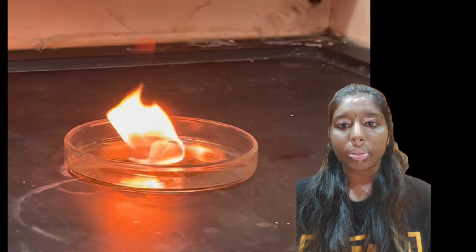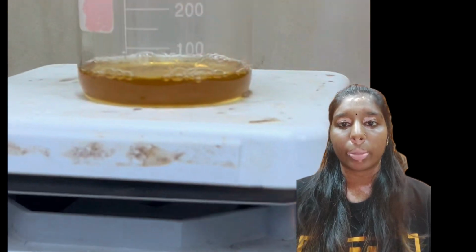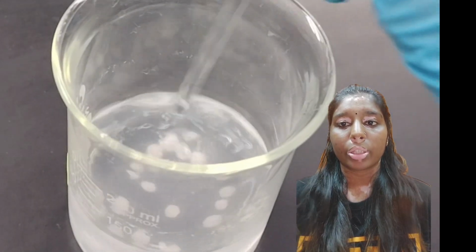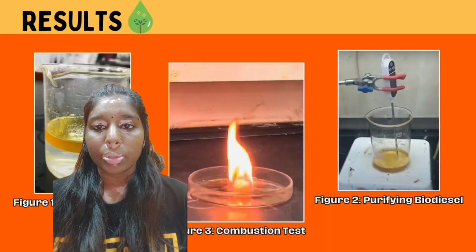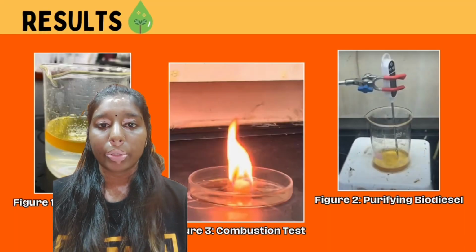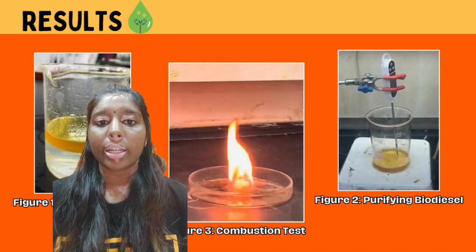So the key to this good outcome was to keep the reaction temperature below methanol's boiling point and ensure that the sodium methoxide was thoroughly mixed with the heated oil. This outcome shows that the experiment successfully produced biodiesel, corresponding with the objective that was specified in the experiment.